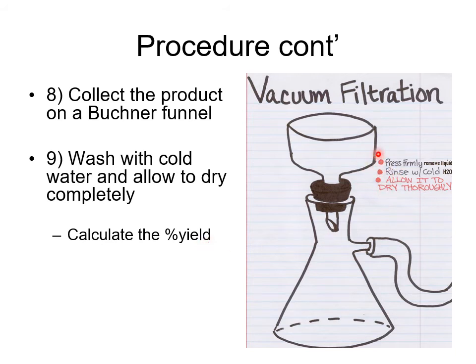If you want to make sure this is completely dry, you can press down on it with a spatula or something to make sure all the water is gone. It's difficult to dry these things in the class when everything is in a hurry, but for the most part, you should have less than what you started off with, not more, right? Because usually what ends up happening is there's too much water, and people end up getting a higher mass than what they initially expected. So that's one thing to look out for with this part of the procedure.